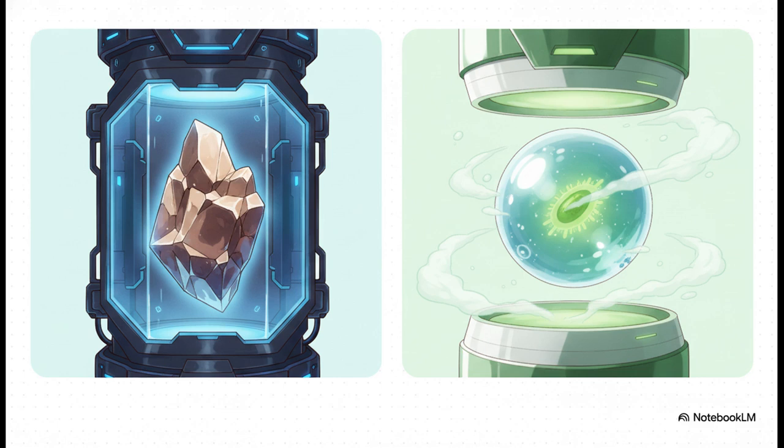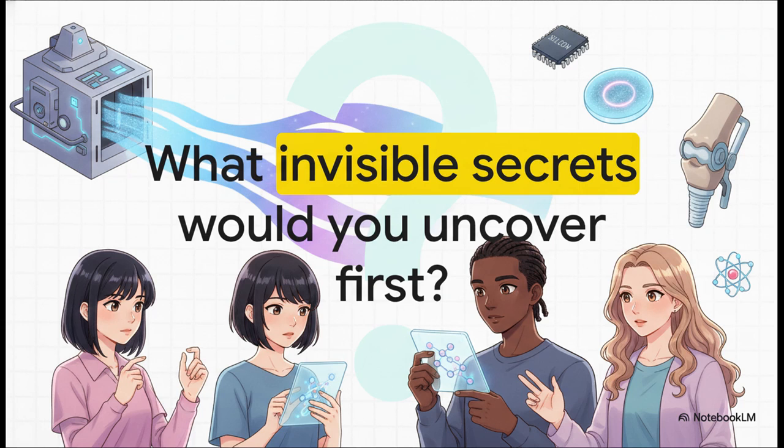To sum it all up, X-ray photoelectron spectroscopy is a truly indispensable tool. Building off Einstein's photoelectric effect, it gives us unparalleled insight into the microscopic chemical world. Its ability to provide quantitative, chemical state data from just the outermost atoms shapes everything from the chips in our electronics to the life-saving implants in our bodies.